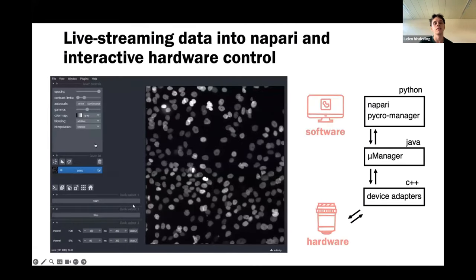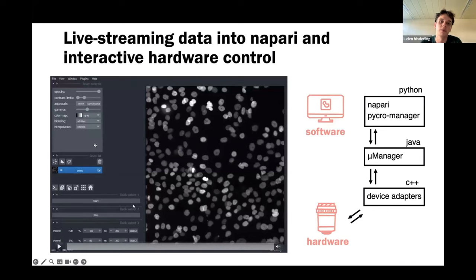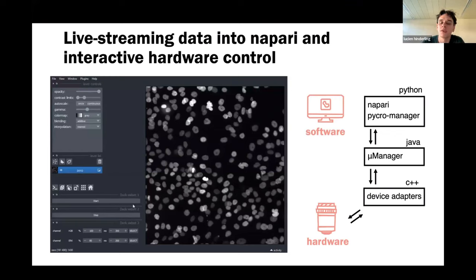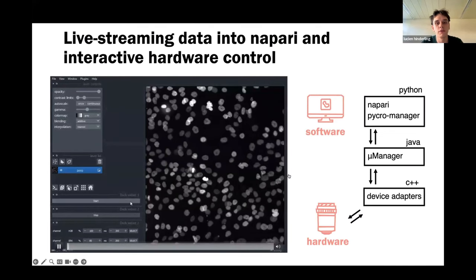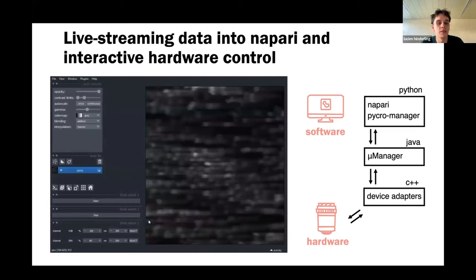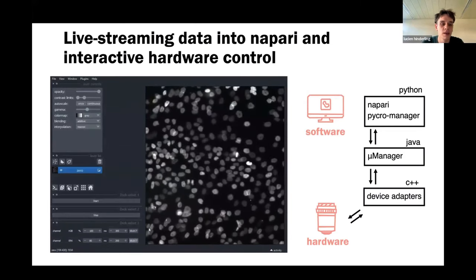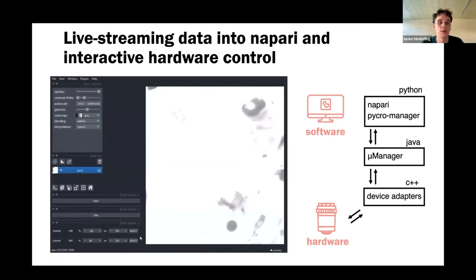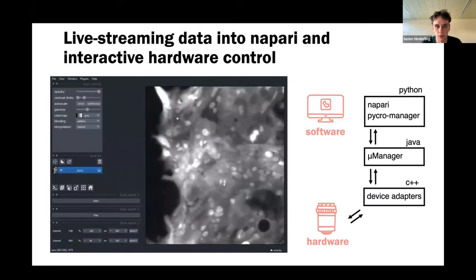We need to live-stream data from the microscope into Napari. We already use Napari in our processing pipelines, so it's a natural choice as an interface. Here you can see a movie of data live-streamed from the microscope. Because it's Napari, it's very easy to add interactivity and widgets — you can switch channels, change exposure times, and so on. It's about 10 lines of Python code to access these microscope functions.